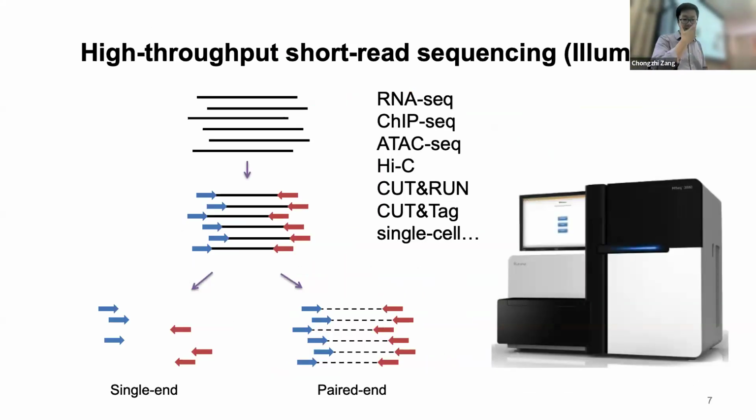Before doing that, I'll briefly go through how high throughput short read sequencing works so that we can understand where these data come from.